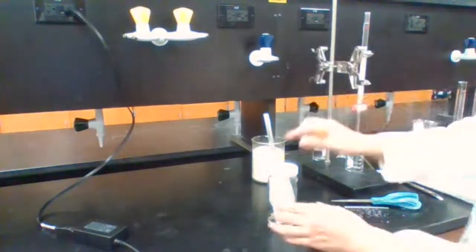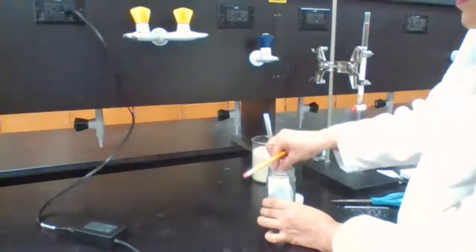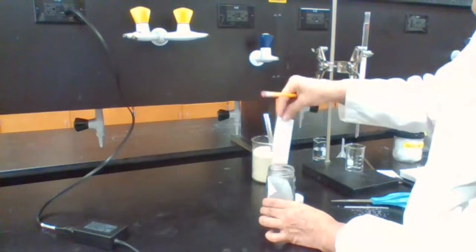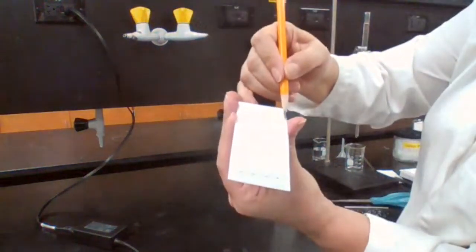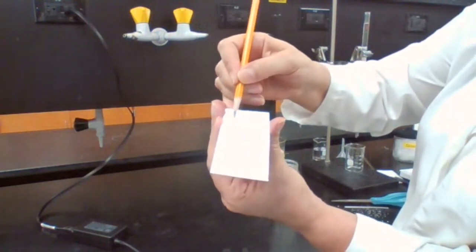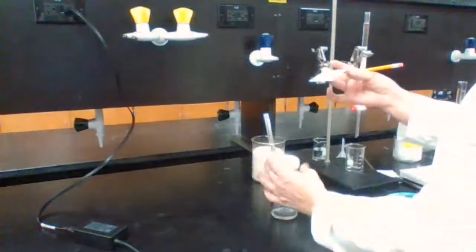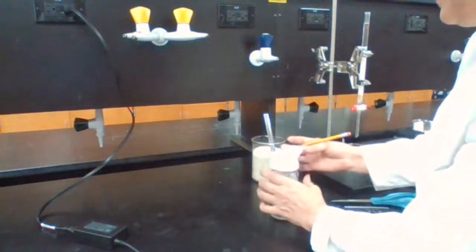Okay, before causing any trouble to myself or you, I'm going to take out the plate. Right away, I have to mark it, otherwise when it gets dry, I can't see. So I have the line that the solvent has moved up. I wait until it's dry, then we take it to the UV lamp.